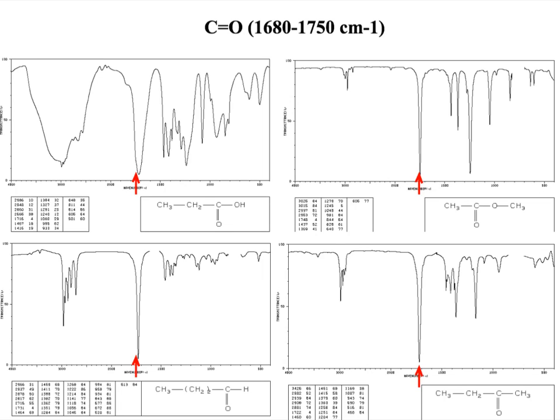So these diagrams show C double bond O. What do you think that is? Is that an OH in an alcohol or an acid? Hopefully you can spot straight away that's an acid because it's joined up with the CH. Over here you've just got C double bond O. There's the acid, so that's propanoic acid. This one, you can see C double bond O here, and again here. In all these examples, the C double bond O is quite thin, quite sharp, and very deep.